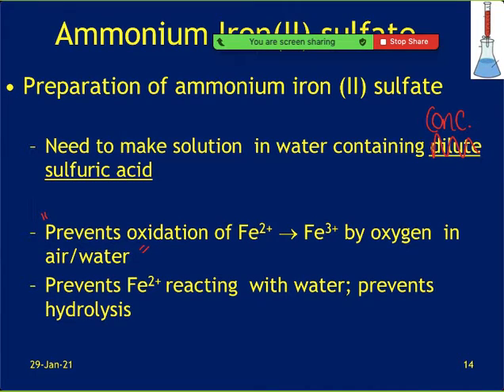So we add sulfuric to the KMnO4 to ensure it goes from +7 to +2, purple to colourless. We add sulfuric acid when we're making our solution of iron, and we're doing it to prevent oxidation of iron 2 to iron 3, because if we didn't put in the sulfuric, we would get a really low titre, as it would already have changed by the time we'd get to titrate it.